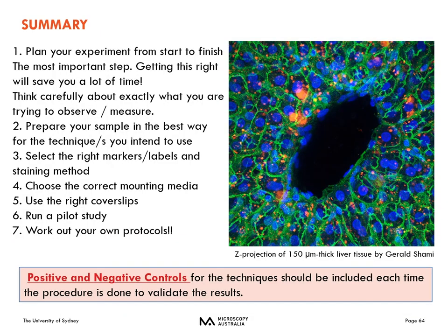In summary, we have a couple of key points listed below. First, you have to plan your experiment from start to finish. This is the most important step. Remember that getting it right will save you a lot of time. And think carefully before you try to observe and measure, and prepare your sample in the best way for the techniques you intend to use.